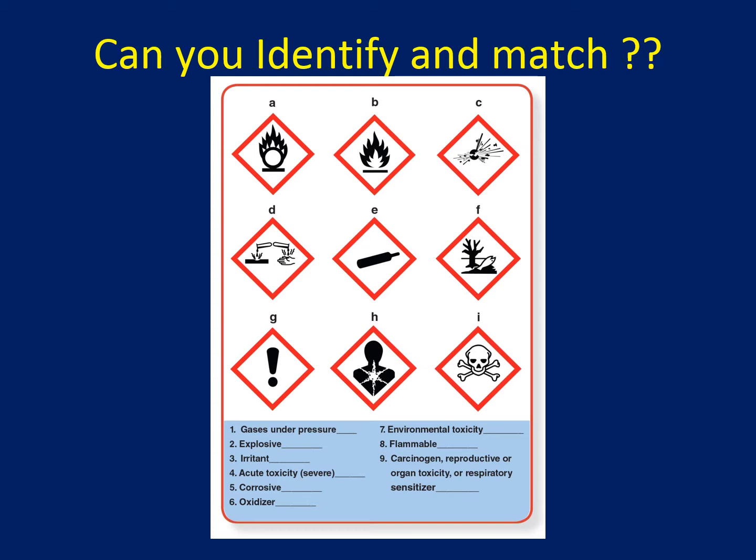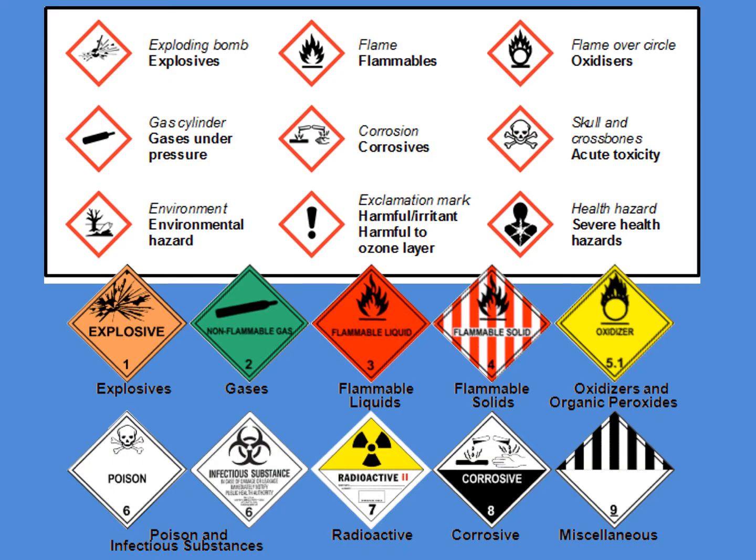Similarly, while you are working in the lab, you will have to learn all the symbols, but those symbols will appear in different scenarios. I mean, depending on the chemicals, depending on the experiments.